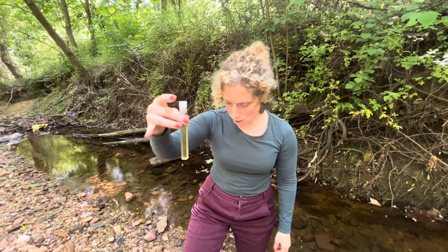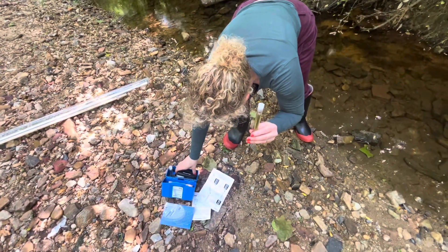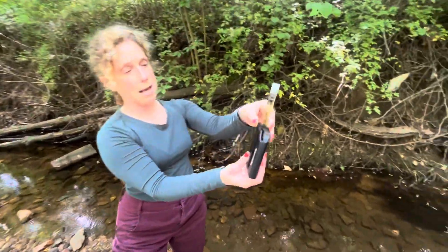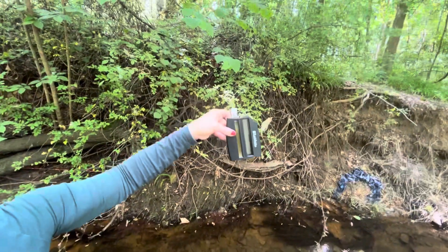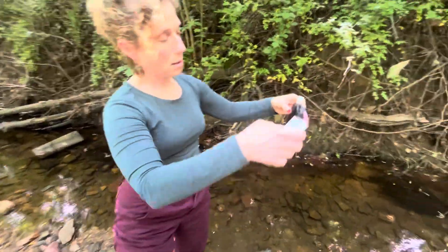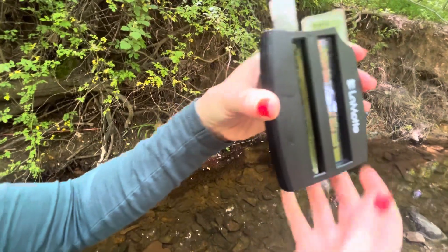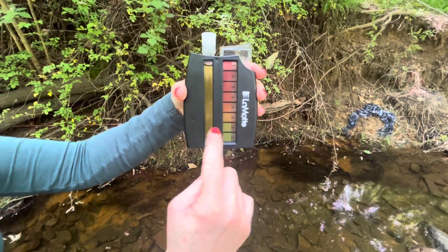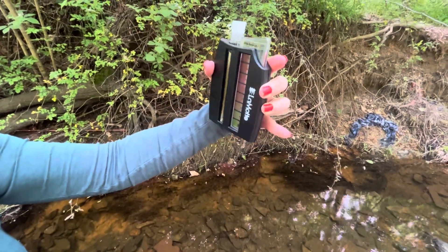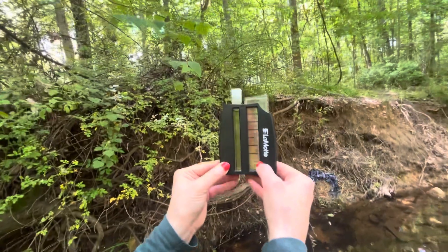Give it just about two minutes, and then when you're done with the two minutes, you put it inside here and also put in one of these color comparator cards. What you're trying to do is match the colors to figure out what the pH is. If I look at this, it looks like right around 6.0.